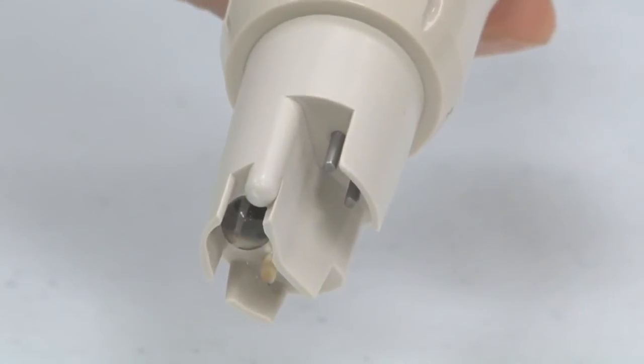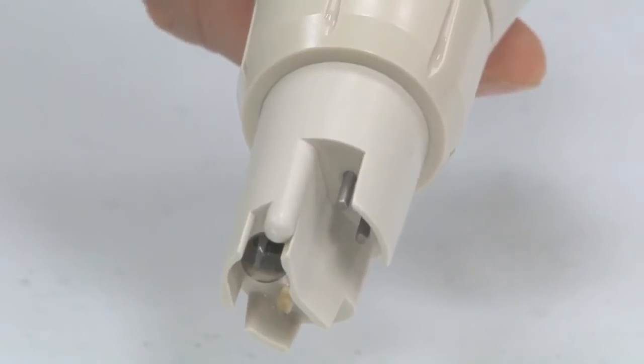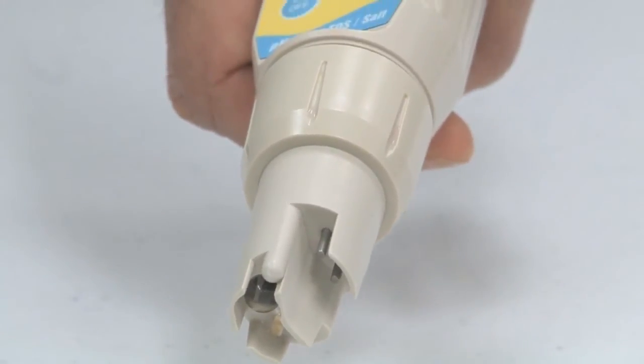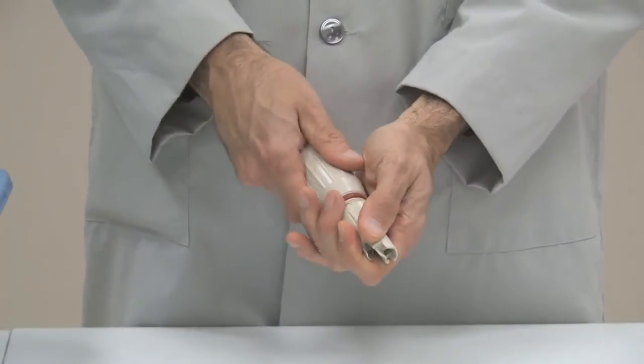Long-life sensors feature a PVDF reference junction for pH and stainless steel pins for conductivity. A recessed design helps protect the sensors from damage.